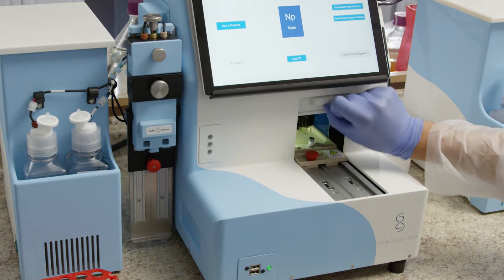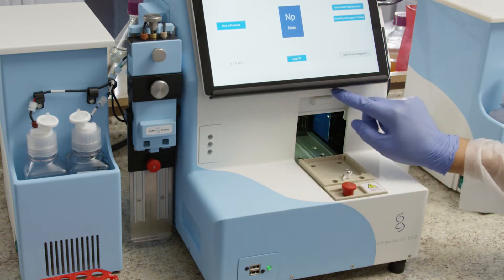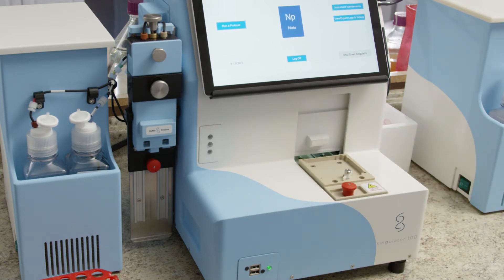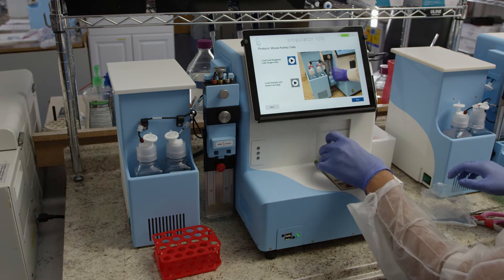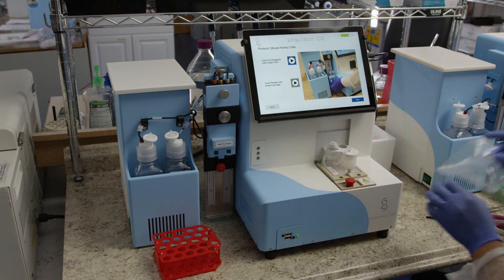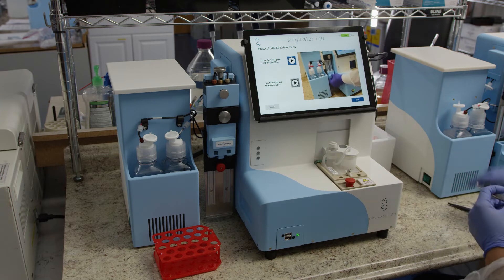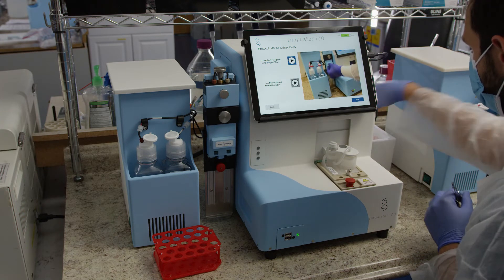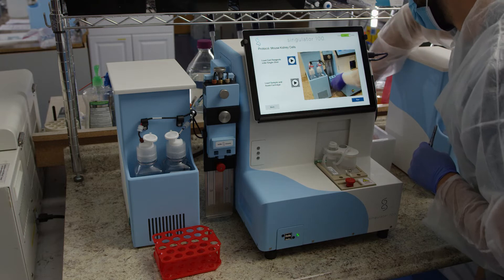Open the door in the front of the Singulator. Lift the red knob to release the sample stage and slide the stage out of the Singulator. Place the sample cartridge on the sample stage in proper orientation so it sits flat on the stage. Rotate the cartridge lock to secure the cartridge in place.